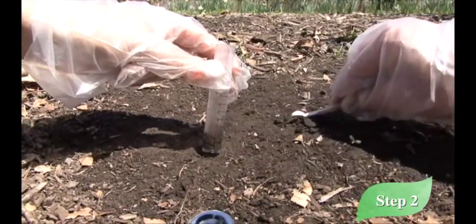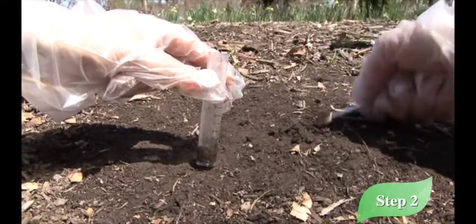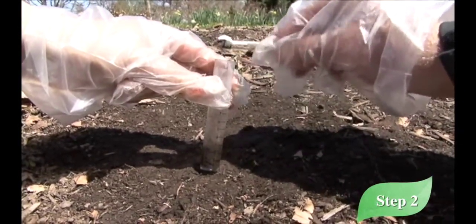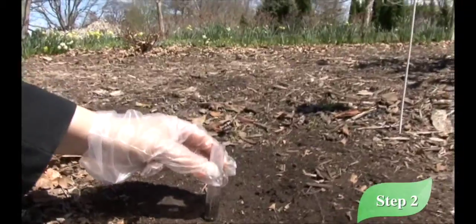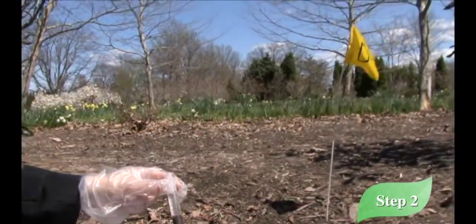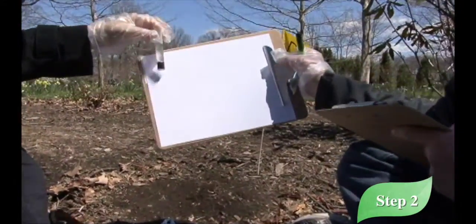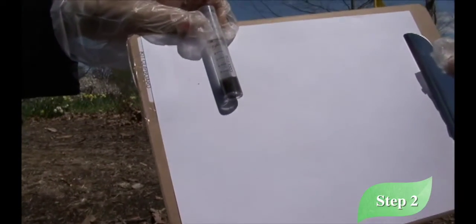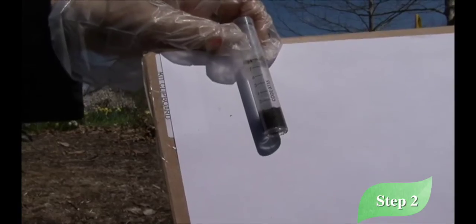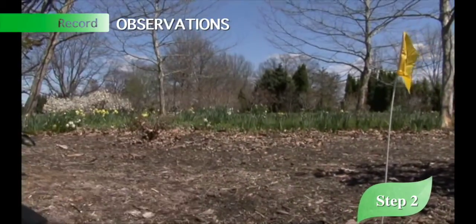3. Just get a little bit level. And about 4. You want to make sure not to push it too hard because then it's hard to get it in the actual... Yeah. And now that the solution has soil in it, if you look at it carefully, it looks like it's starting to dispense and there's a few little bubbles there. Mm-hmm. Could be air bubbles trapped in the soil. Exactly. Let's go to step 3 while you write those observations down.